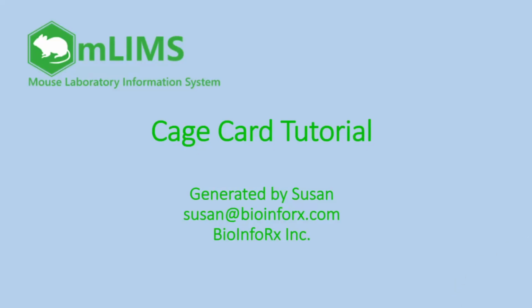mLIMS Cage Card Tutorial, generated by Susan from BioInfoRx. mLIMS includes a cage card feature that automatically pulls information from your colony data to generate printable cage cards for colony management.